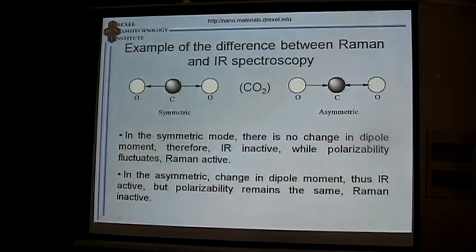That's why Raman spectroscopy is so widely used for analysis of all carbon materials, including carbon nanotubes here. So, to finish with the difference of Raman spectroscopy, the same molecule, carbon dioxide in this case, can produce Raman and IR spectra, but those will be just different vibrational modes.